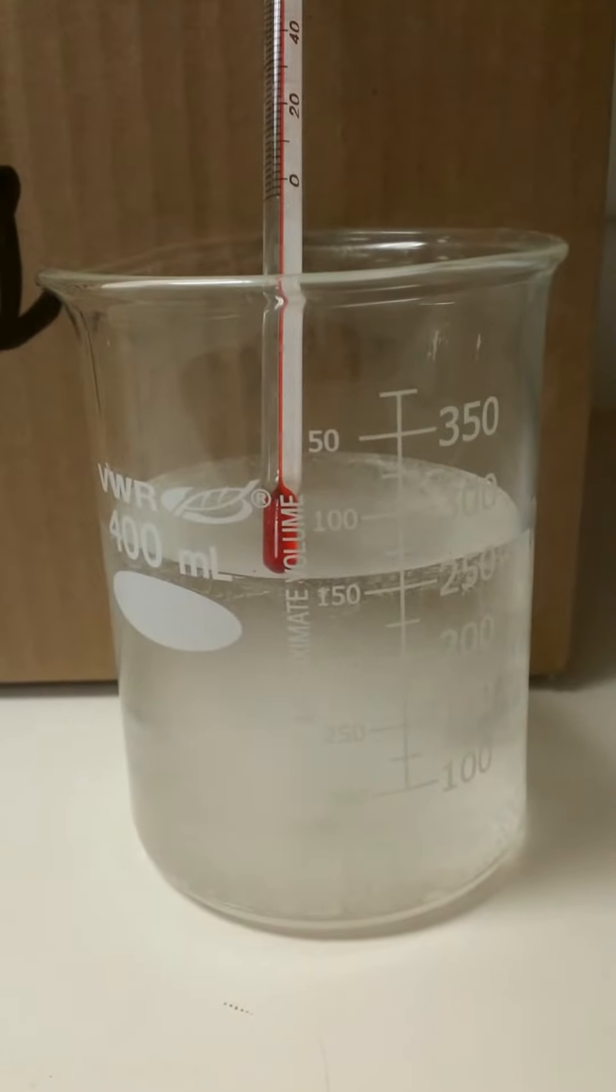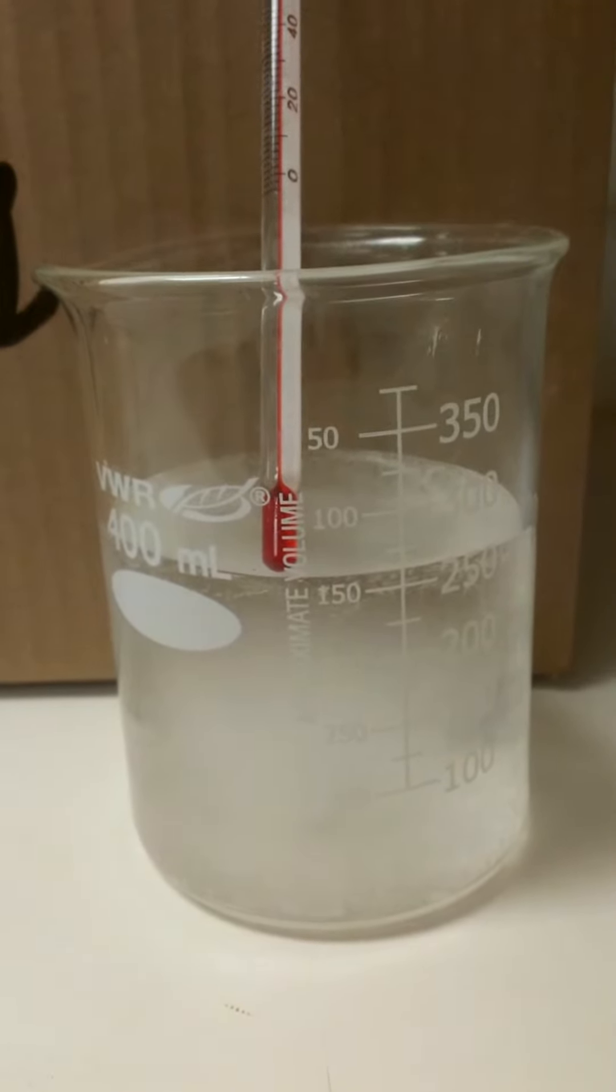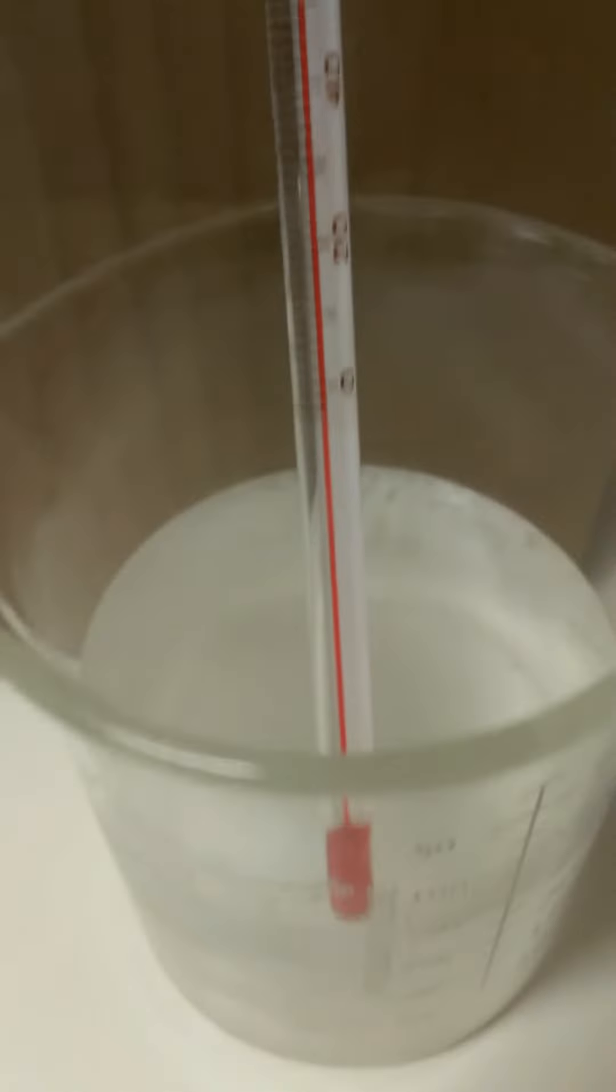So here are the test results. This is the water. You can see that it's crystalline.